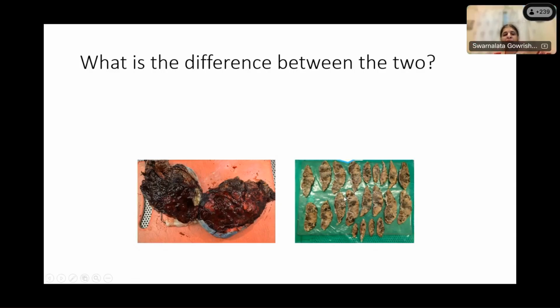So with experience, you will know when the tissue is right to get into the processor. Remember the window of 6 to 72 hours. Yeah. So with this tissue, I'll have one more question for you. This tissue is red and hemorrhagic, maybe a congested spleen or liver, I don't know. And you put it in non-buffered formalin. What is the artifact that you will get on your sections?